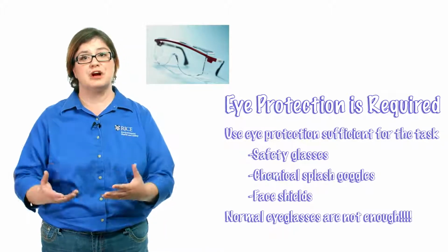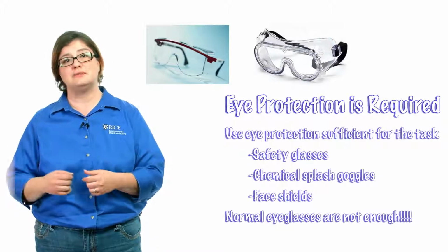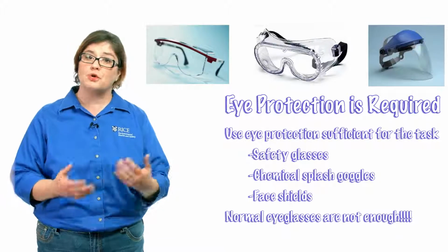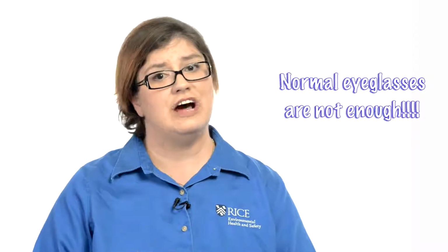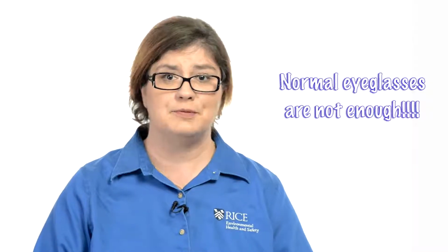However, if you're working with large volumes of especially corrosive or volatile materials, you may want to get out the chemical splash goggles. For particularly dangerous procedures or when working with cryogenics, you may want to get out the face shield. Normal prescription eyeglasses are not adequate protection. They are not impact resistant and they offer very little shielding against splashes in the lab.